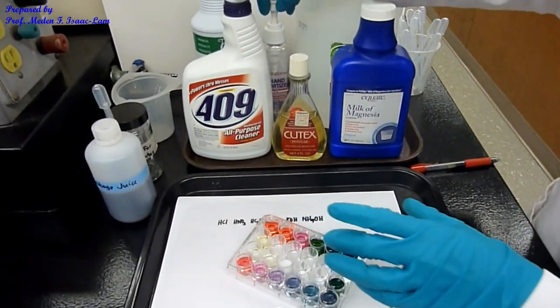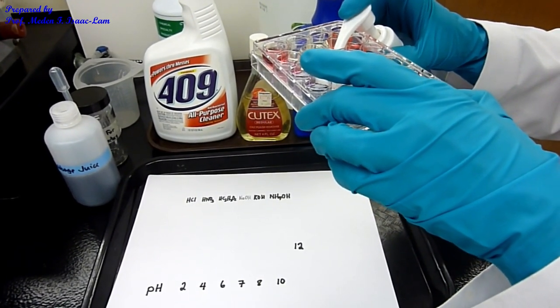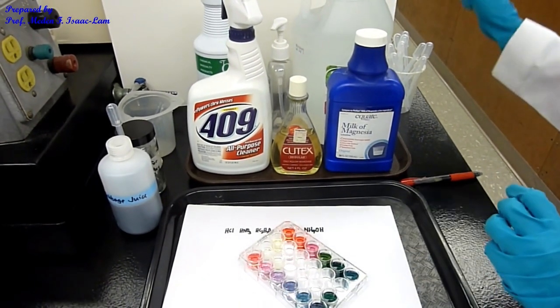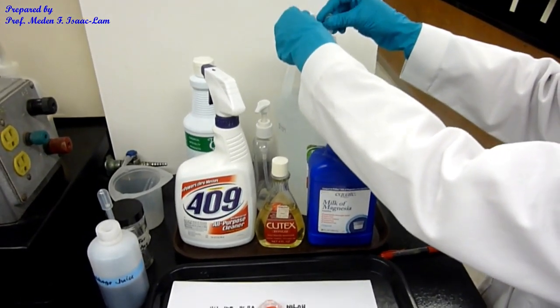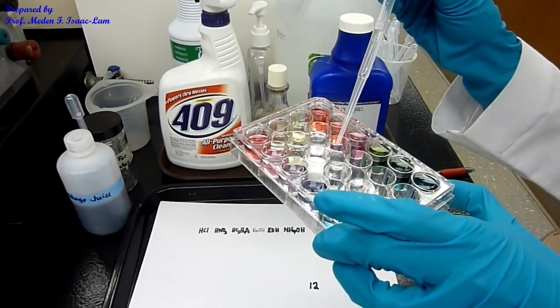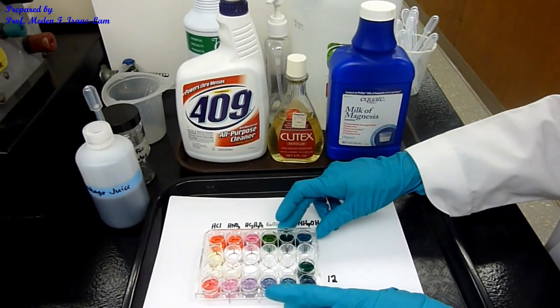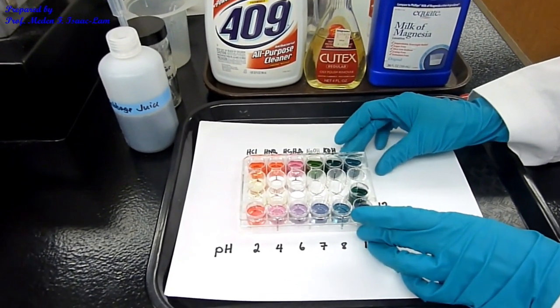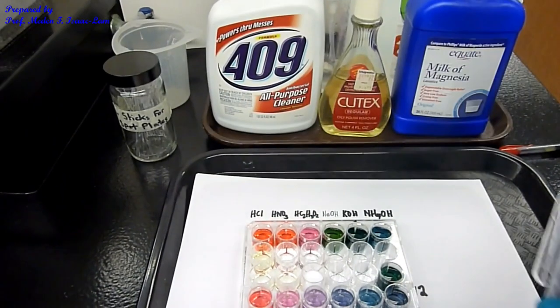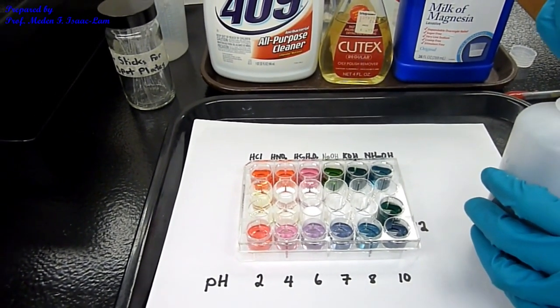And then I'm going to do the hand sanitizer, and then the vinegar. So we have all the six solutions in here. Again, let's review. Exactly, I did this row and then this row at the back. Now cabbage juice, same idea. We're now going to add 20 drops. Note the color.